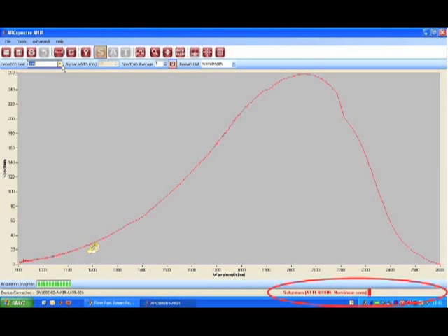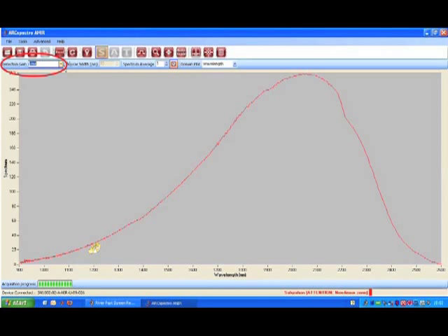The software already shows your spectrum. However, if you look on the lower right corner on the saturation bar, you will see that only a very weak signal arrives on the detector. The sensitivity of your spectrometer is tuned by the detection gain on the upper left corner.